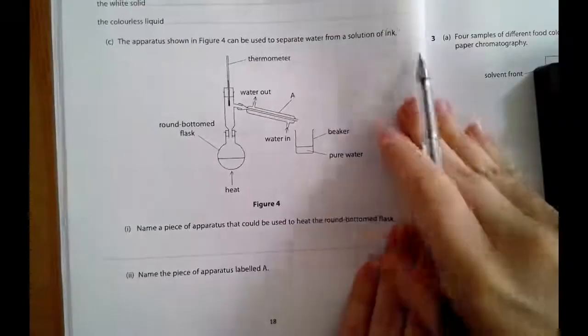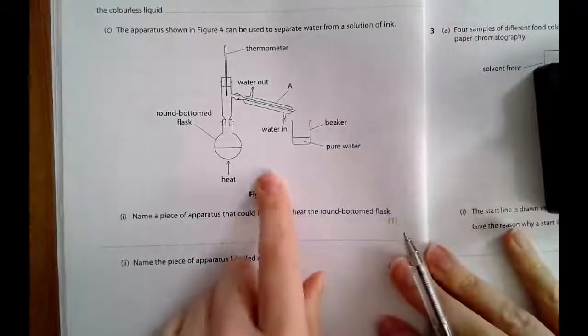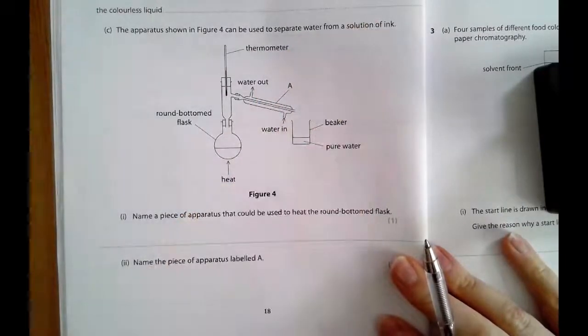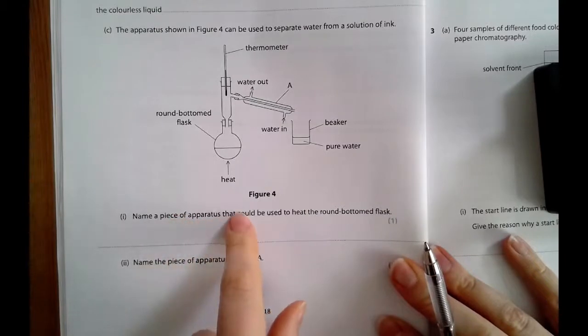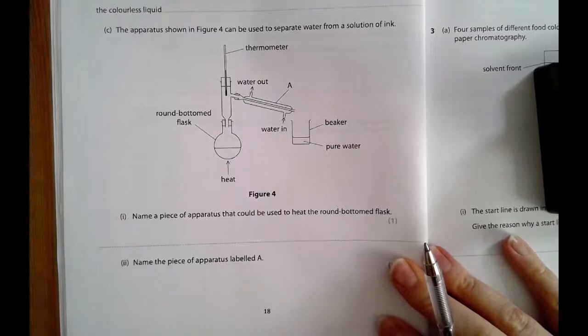Okay, if we look here at an exam question on it, you have got the apparatus for distillation and you're using it to separate water from a solution of ink. So you can also use distillation to separate two liquids that have different boiling points. The first question asks you for the apparatus used to heat the round bottom flask. You could say a hot plate, a Bunsen burner, a heating mantle, anything that's used for heating.